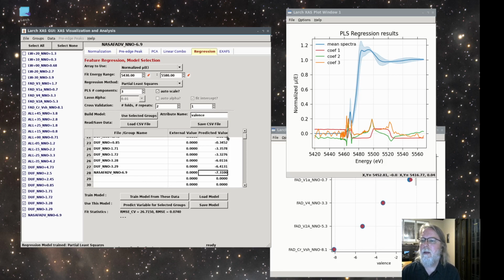So I think this is a relatively short presentation compared to the previous one, but I think that gives you an indication of what sort of things might be able to be done with linear analysis of XANES beyond just linear combinations to say that 2 spectra are a linear combination of two other spectra, and from that determine oxidation state or chemical environment.